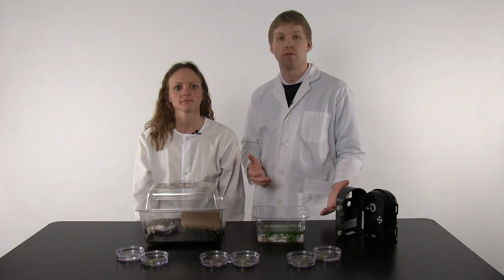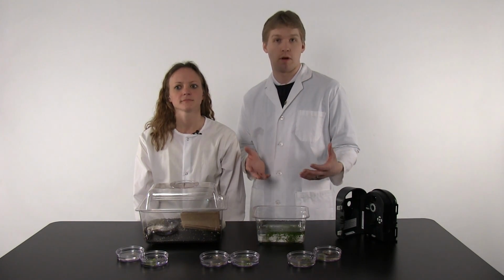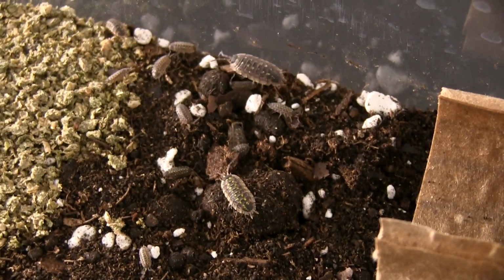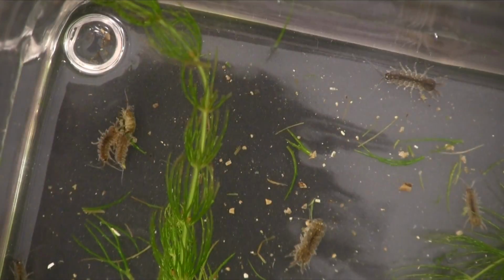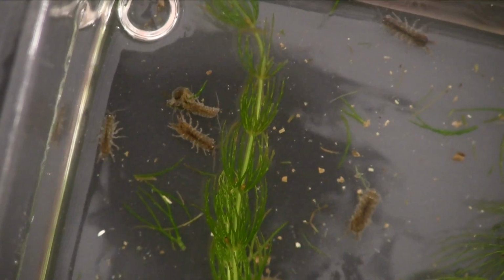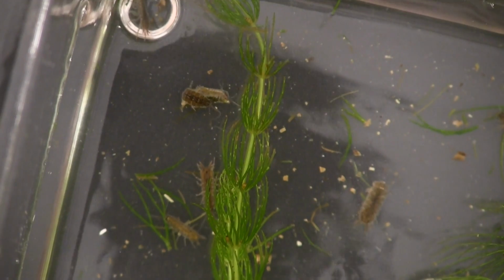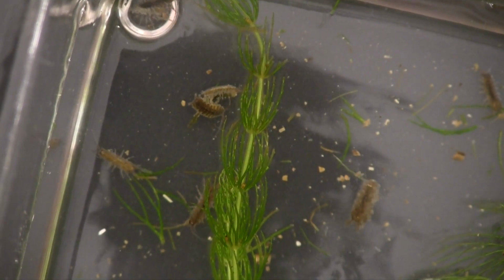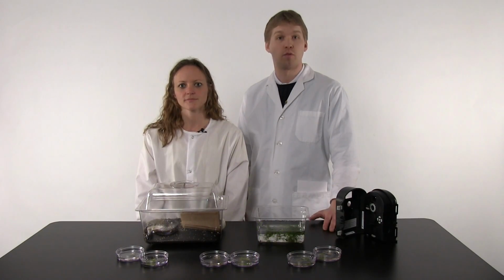The first thing you want to do is familiarize your students with the difference between an aquatic sow bug and a sow bug. One noticeable difference is the habitat they live in. The sow bug likes dark, moist, and cool environments on land, whereas the aquatic sow bugs live solely in water. However, they too like dark areas to dwell. Physically speaking, they both have gill-like structures. You can see the difference by looking at the two, but then you can see in greater detail under the microscope. The brief experiment we'll be focusing on is food preferences.